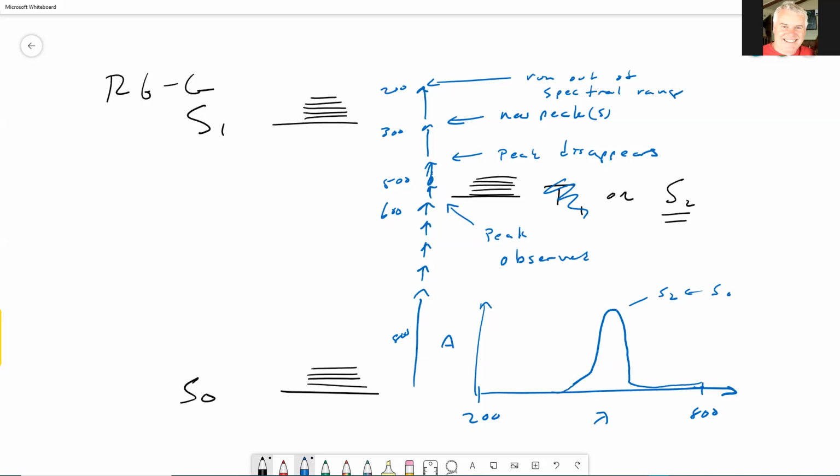And then it goes back down to 0 again. And then when we get up to, say, around 300 nanometers, this guy might be around 500 nanometers. And we'll see more peaks, right? And I'm only doing this to make the one point, which is that as you scan along a spectral axis here, you scan through the available energy states of the molecule, right?